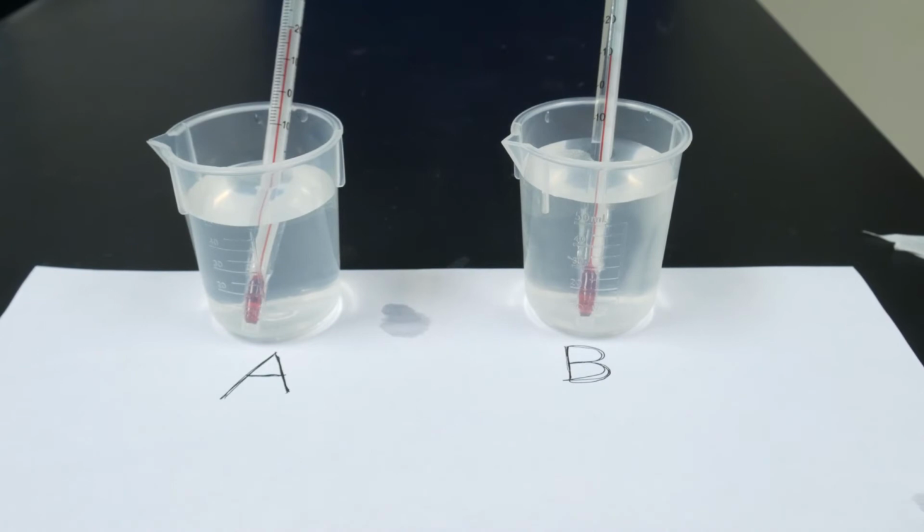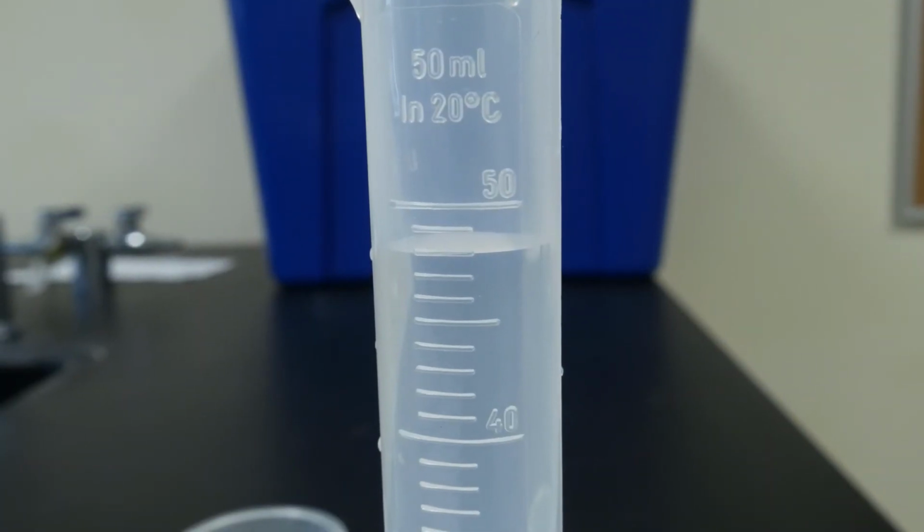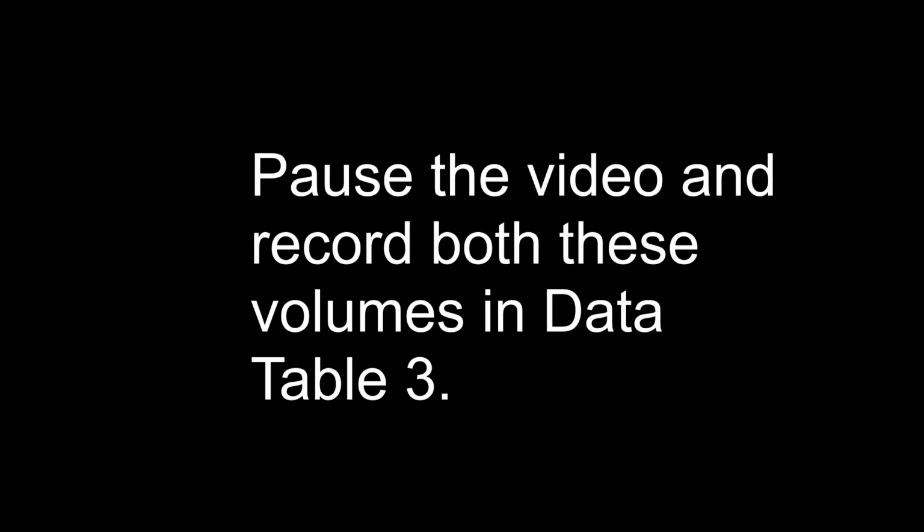So now we're going to pour each liquid into a graduated cylinder and see what the volume reads after one of them has been cooled down and the other one has not. Looking at the volume for beaker A, it looks like the liquid is still at about 50 milliliters, which is what it was at before we started this 5-minute timer. So looking at the graduated cylinder of the liquid for beaker B, it looks like our volume went down by about 2 milliliters. That's kind of interesting.